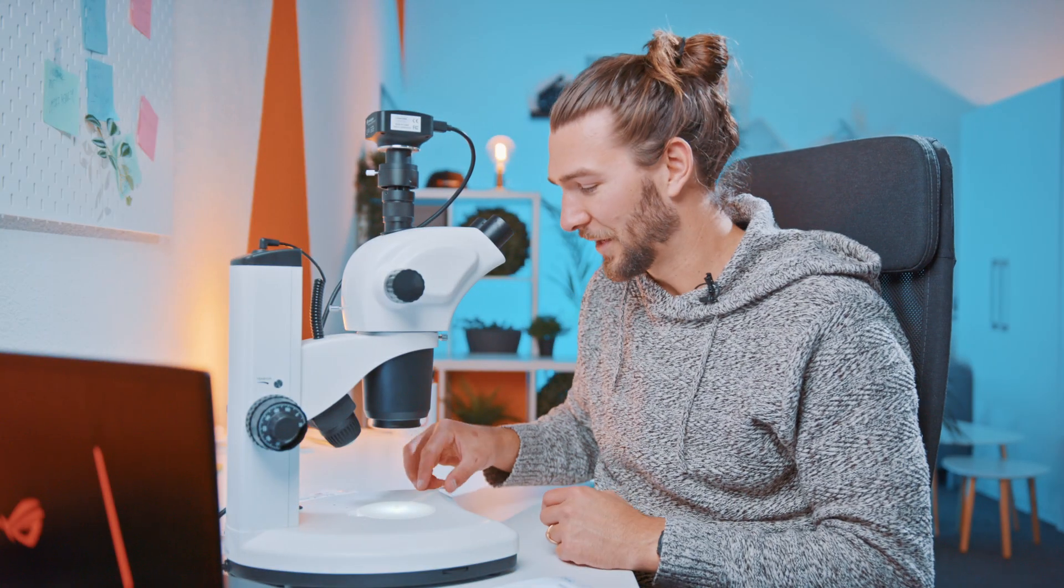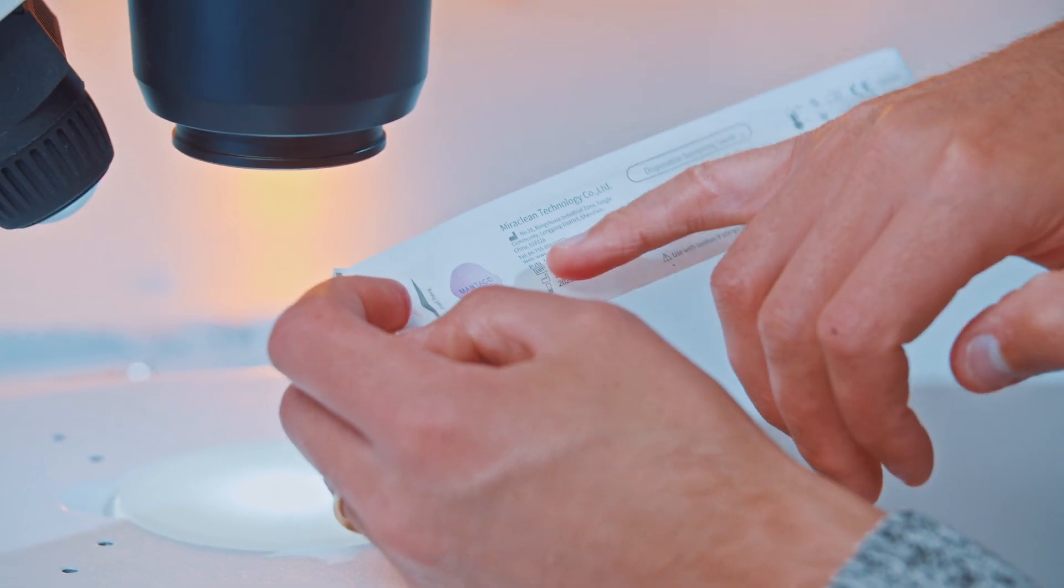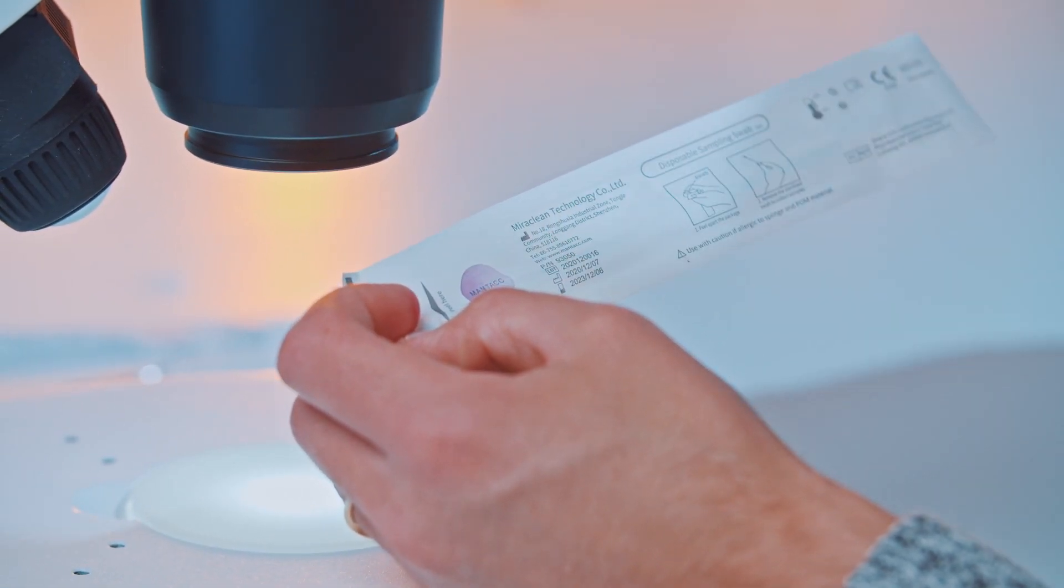So let's compare this one now to the next product here. So we've got another brand here: Miraclean Technology. Okay, this one definitely looks more like a sponge. You see all these bubble textures. This looks like one of my videos I made before of household items, and there we looked at a cleaning sponge and it looks exactly the same. But it's not so soft. The bubbles texture was nice and finished off smooth, but here you can see if we zoom in here.